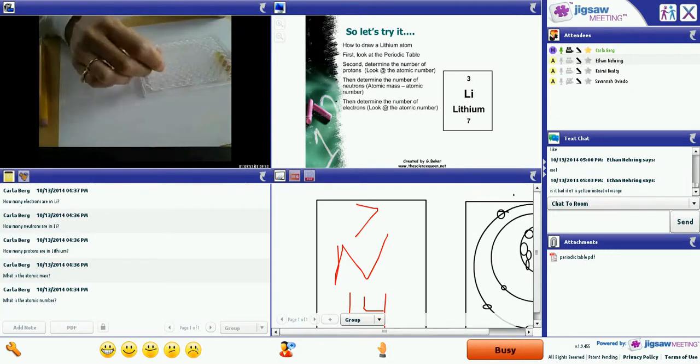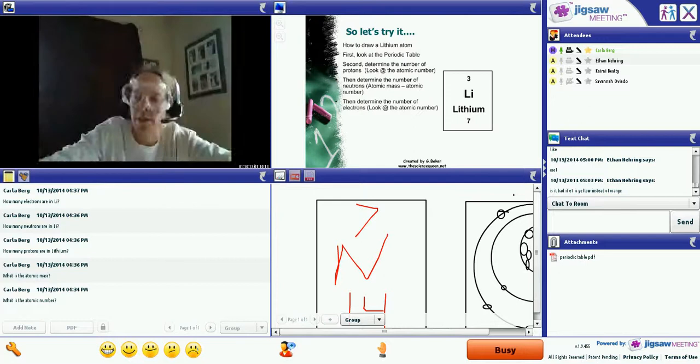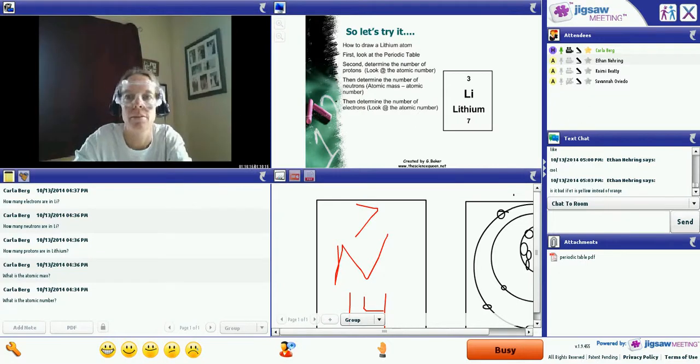Okay, right now I'm stirring my wells, making sure I rinse my toothpick between each stir. My stirring is complete. Oh, my screen went blank. Okay, and now I am at the end of step 10, and I'm going to let it sit.